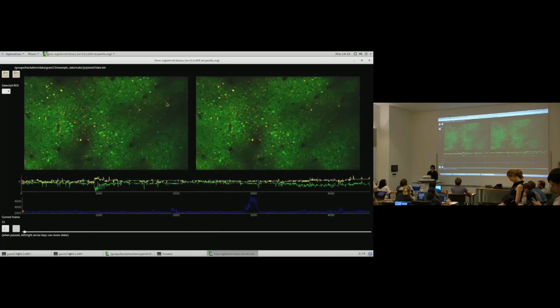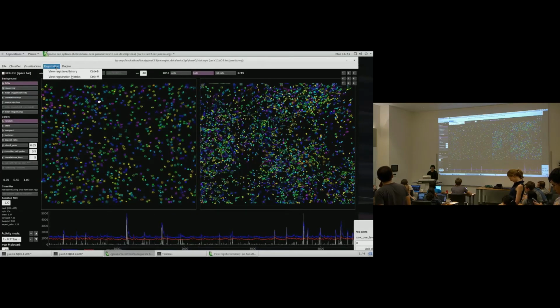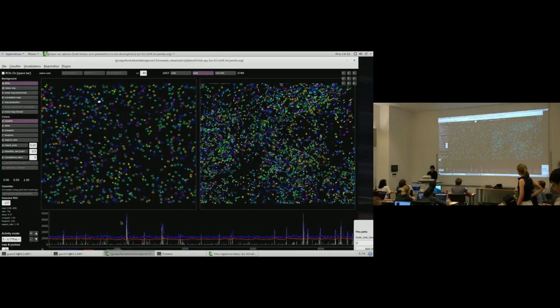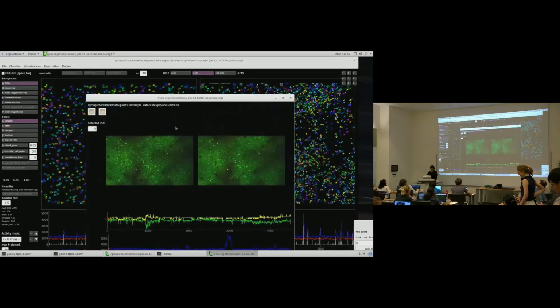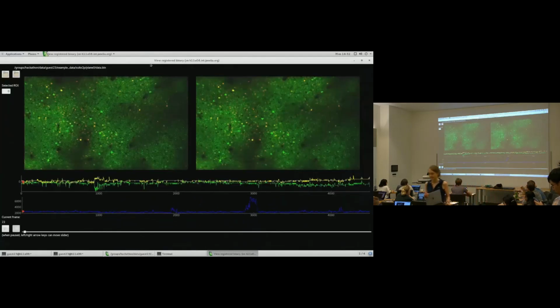Oh, yeah, sorry. I should be more clear. If you press registration, there's two things. There's the view registered binary, and then there's also the registration metrics we talked about earlier. Then here, this is this window here. And now we can play the movie, and we can see.